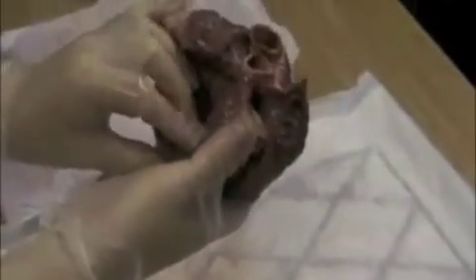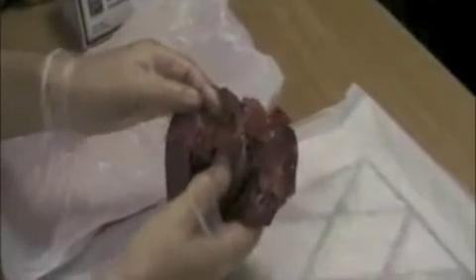The muscle on the right-hand side was impressive to feel. There's one for the left ventricle. Yeah, a huge, big bean-looking thing. And you can see how it will support, if it contracts, the cusps of the mitral valve, the bicuspid valve. Are they the cusps, just those little tiny bits there? Yeah. Well, I'm trying to work one up, but it'll be easier if we do it on the aorta. Considering they've got to work 80 beats a minute for 80 years of your life.